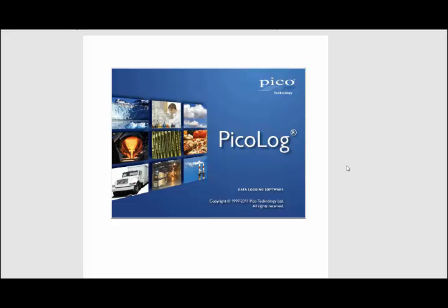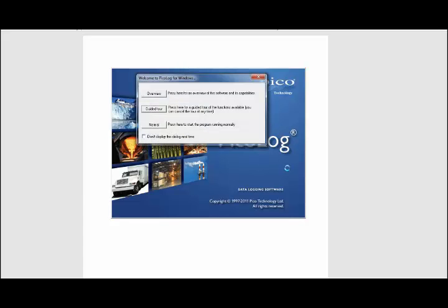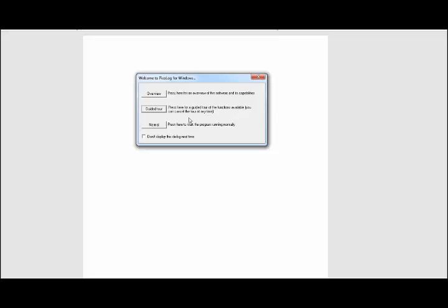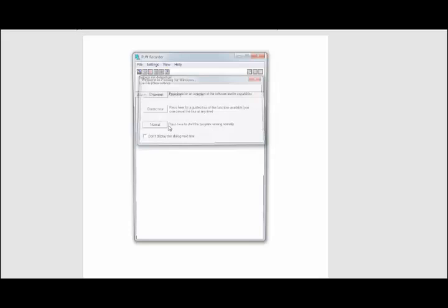Next, what you'll need to do is go to your Start menu and start PicoLog Recorder. It's going to bring up this Welcome to PicoLog window. You can do a guided tour if you want, which basically goes over all the functionality of the software and how to use everything, or you can do normal, which we're going to do in this instance.